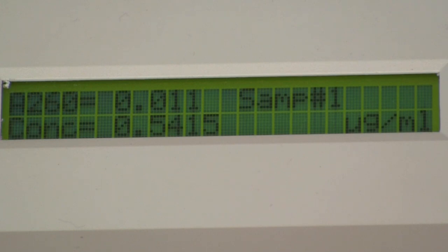The original dilution was 50 to 1, so you will have to multiply by 50 to get the final concentration.